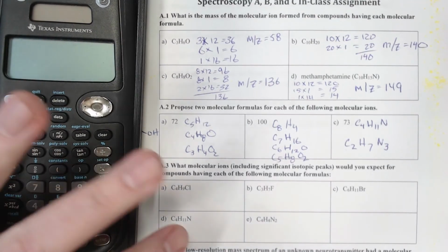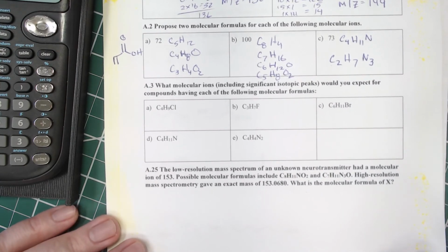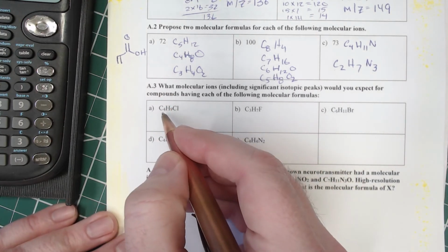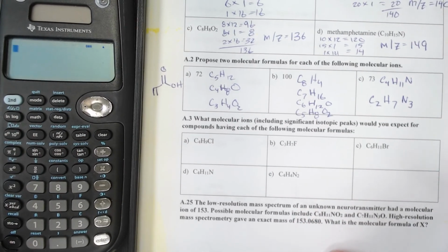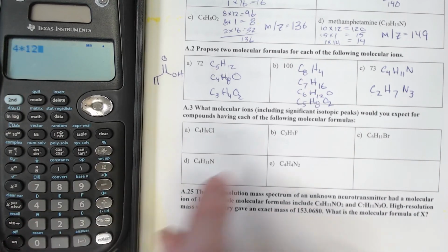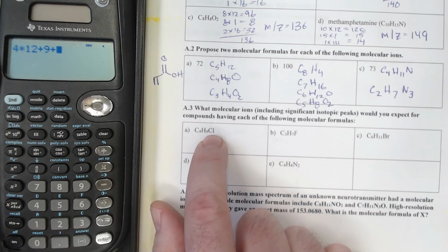All right, so we want to look at what molecular ions we should expect for these, including any significant isotopic peaks. Let's do the C4H9Cl. So 4 times 12 will give us the carbons, and then 9 hydrogens, and then 35 for the chlorine. Remember, we're not going to do 35.45, we're just going to do 35.